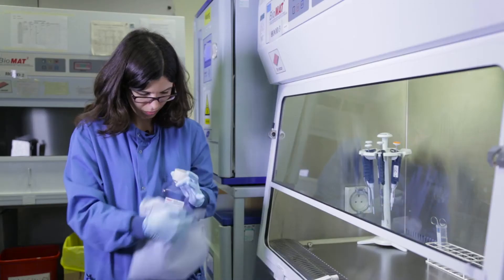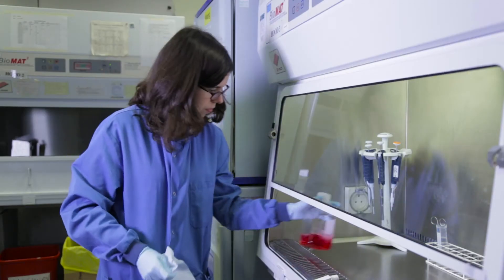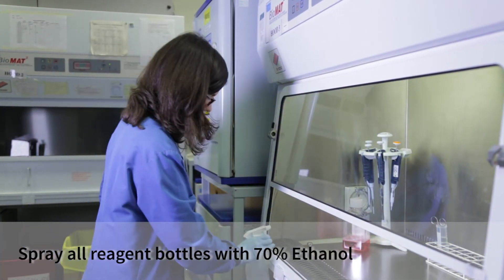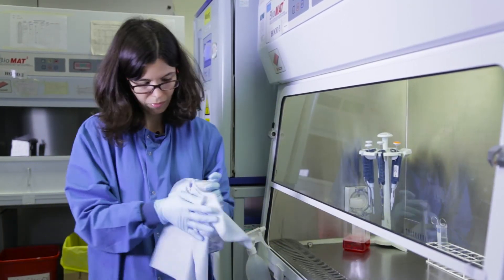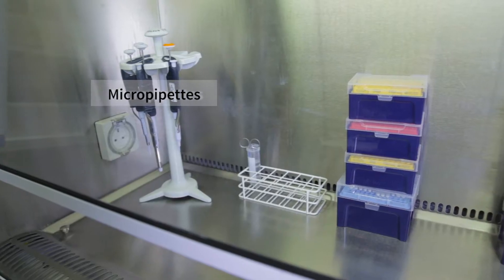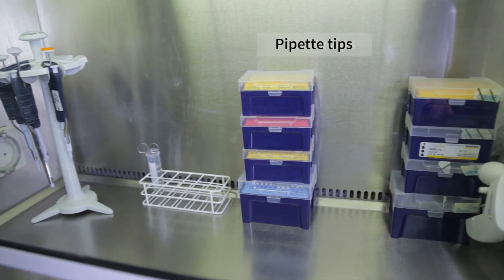In addition, all the reagent bottles to be used should be sprayed with ethanol. As everything was cleaned before introducing it into the hood, everything should be sterile. The hood normally contains pipettes and tips, which are sterile as long as they are kept inside the hood. Now that everything is clean, we are ready to start our TC culture work.